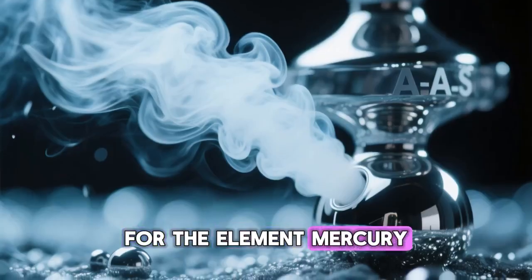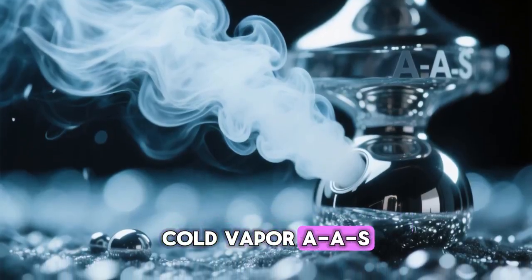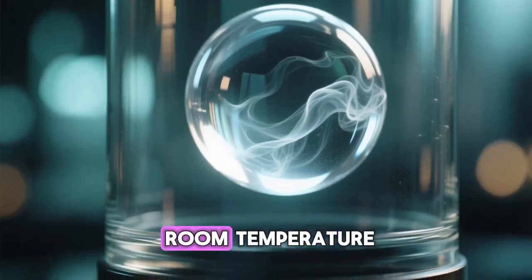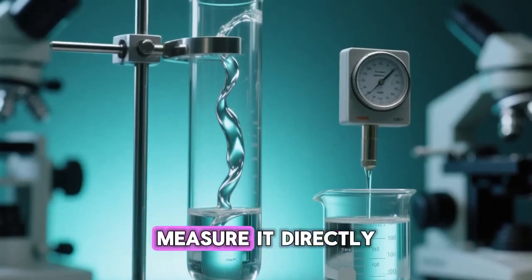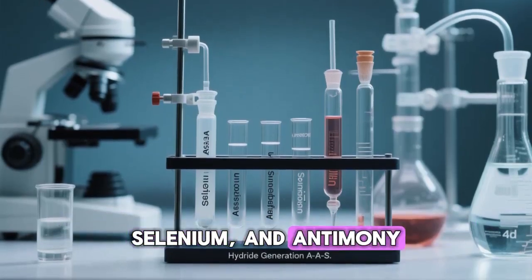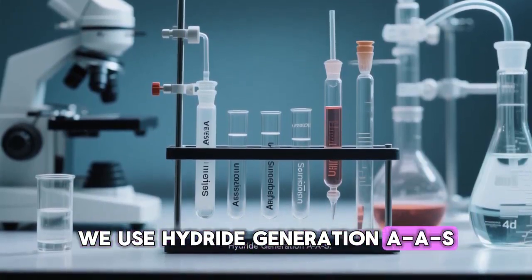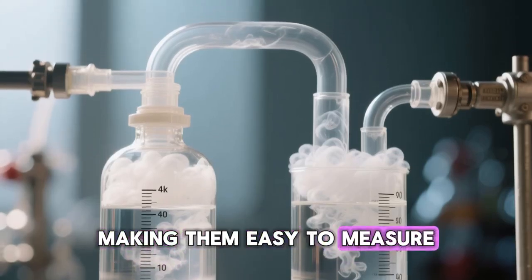For the element mercury, we use a special technique called cold vapor AAS. This takes advantage of the fact that mercury is a vapor at room temperature. We can strip the mercury vapor from a solution and measure it directly. Similarly, for elements like arsenic, selenium, and antimony, which form volatile hydrides, we use hydride generation AAS. This converts them into a gas, making them easy to measure.